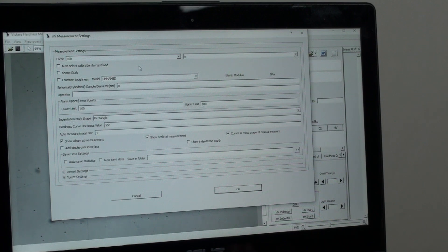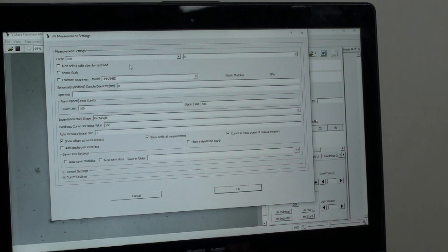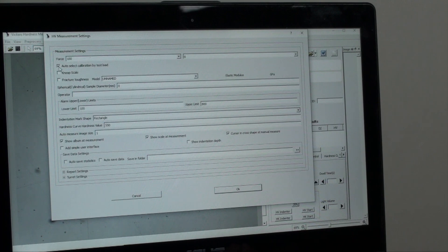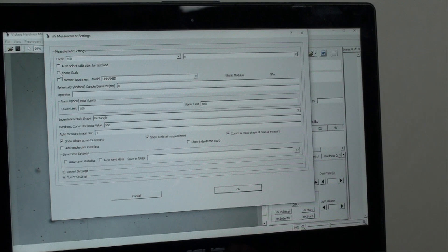If you intend to do Knoop scale testing the check box here must be marked and your penetrator must be swapped from Vickers style to Knoop if you don't have a multi-penetrator turret. You can also set upper and lower test limits, reporting formats, and others from this screen.